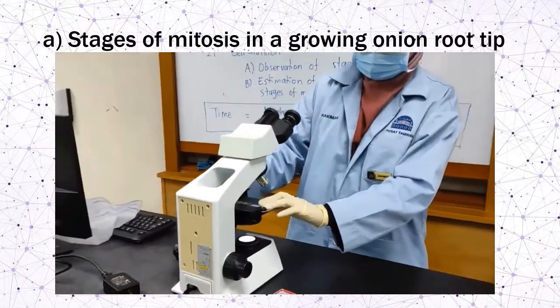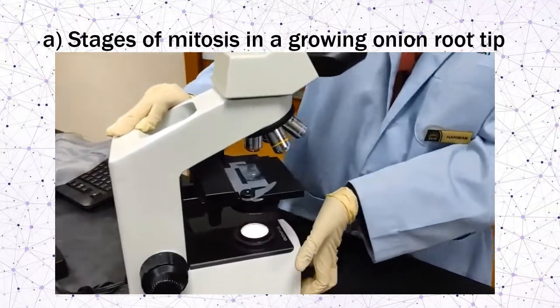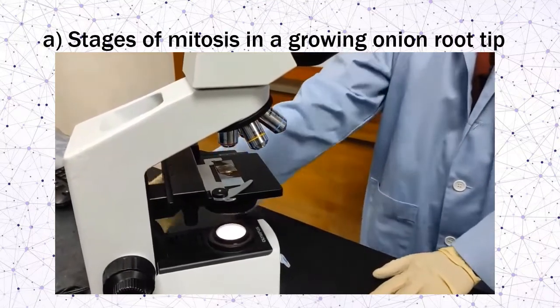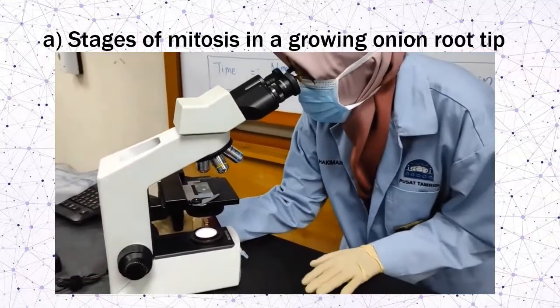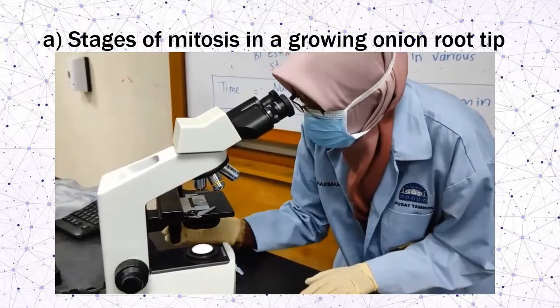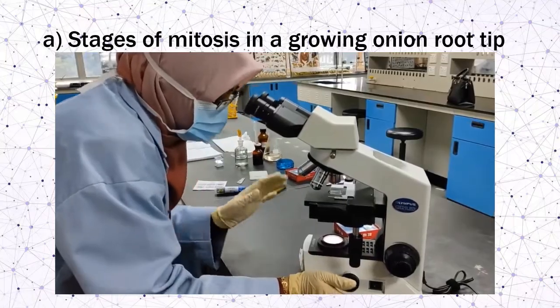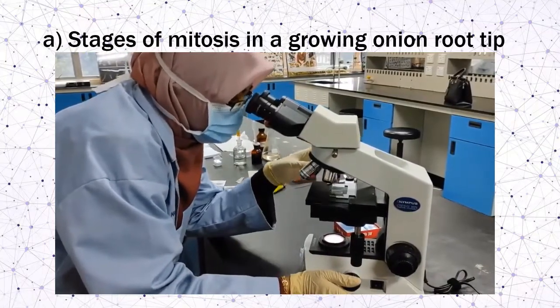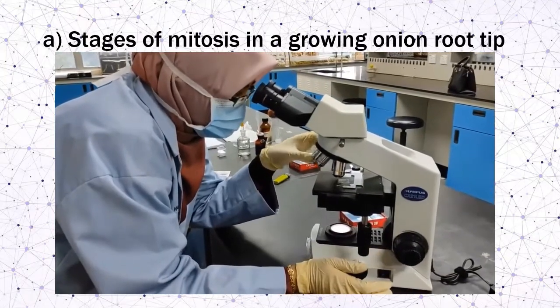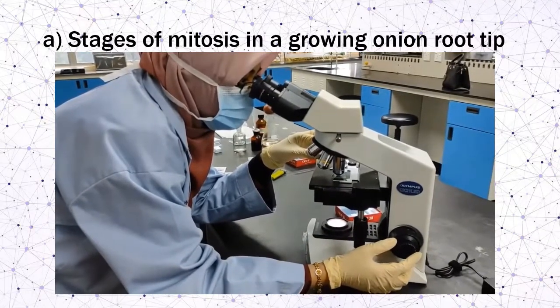Place the microscope slide on the stage. As usual, use the lowest magnification power — four times — and focus your image. Then increase the power to ten times magnification, and lastly to forty times. Make sure you have a clear image of the specimen.